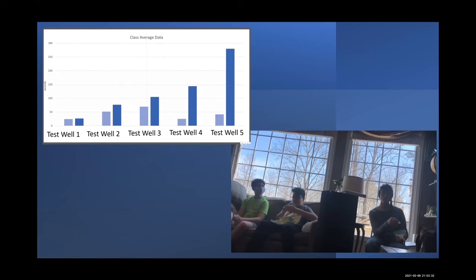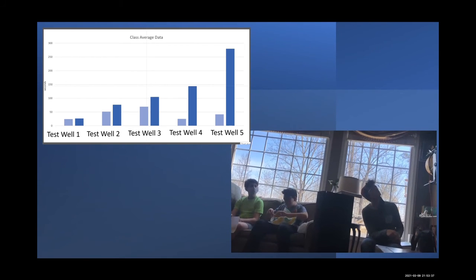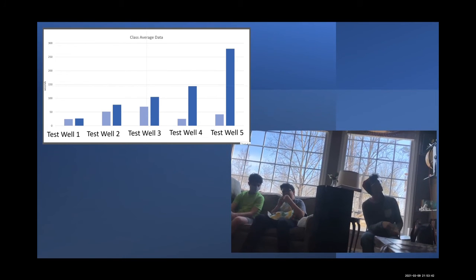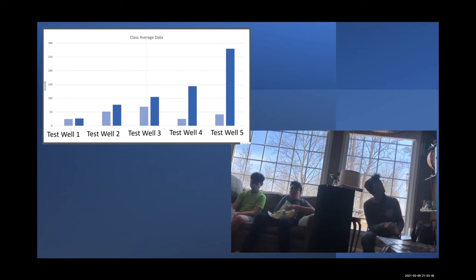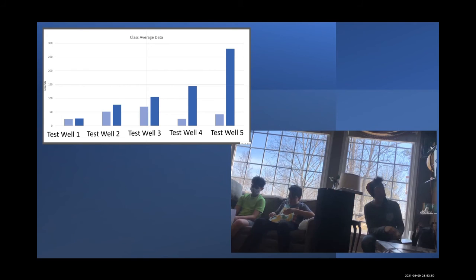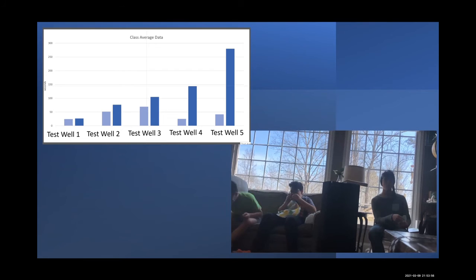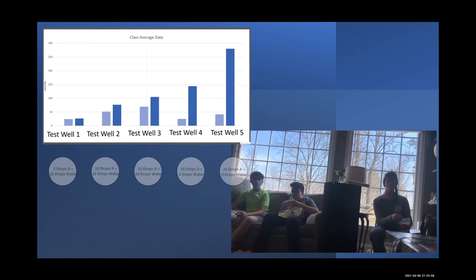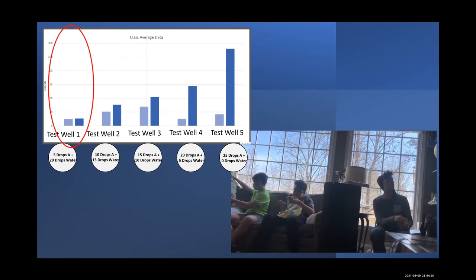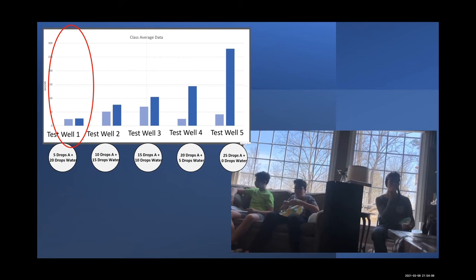So we had to evolve. If you look here, this was how we get a color change. And we had to try and evolve as much elemental iodine as we possibly could. And some of that occurred in the second reaction. So as far as which one of these was likely to finish last or first, this one had less elemental iodine to begin with, right? Because it had less of its solution A to solution B. We had a lower concentration here.